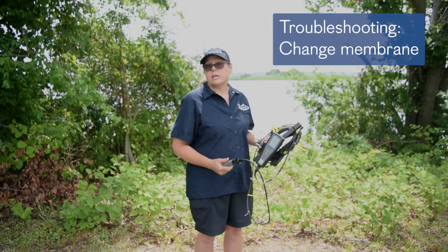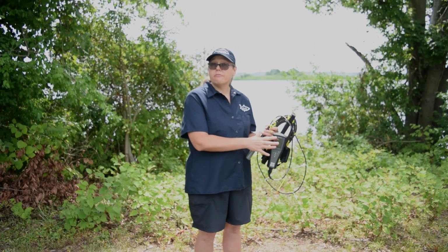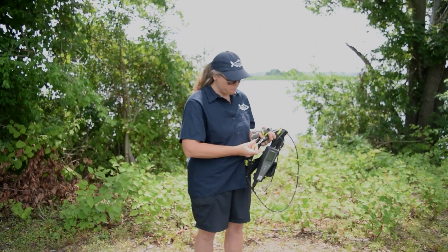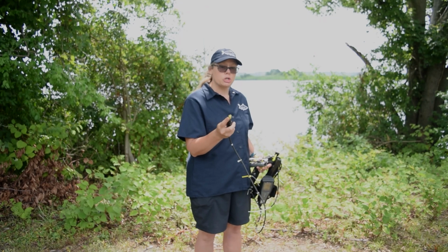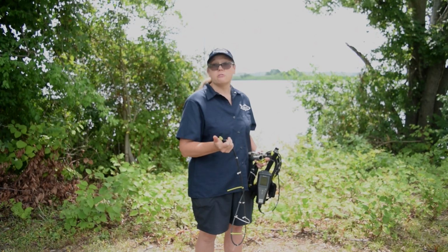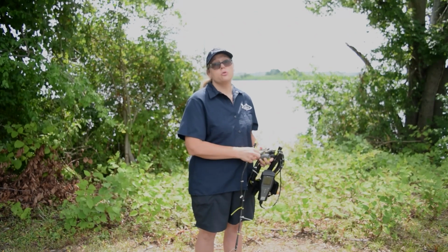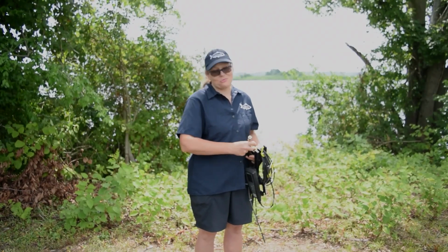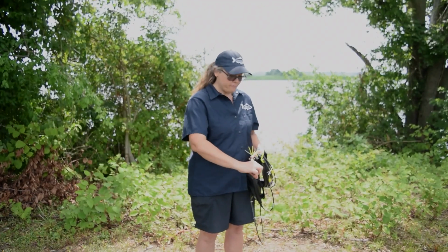If it's still not working and you brought your membrane kit with you, go ahead and turn the meter off, remove the storage chamber, and remove the probe guard. Even if your membrane cap looks good, go ahead and unscrew it. Make sure that there's not a lot of tarnish on the probe itself and replace it with a brand new membrane. You're going to need to give the meter another 15-20 minutes to warm up. That's the downside, but give it a go after that.